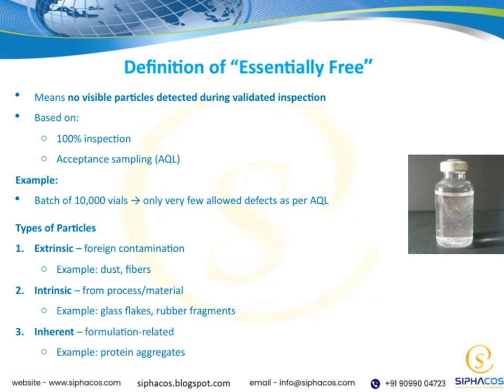Connecting this to the overall theme, maintaining an essentially free status is crucial for ensuring product safety and quality, especially in sensitive applications like pharmaceuticals or medical devices. It's about controlling and understanding the different types of particles to guarantee the integrity of the final product.